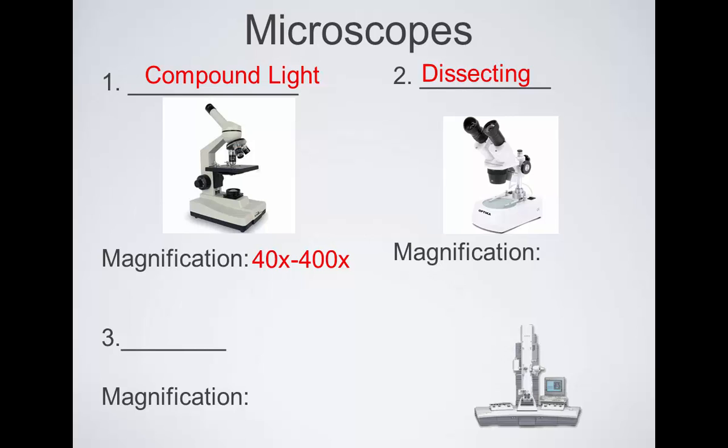That's an important difference because on this microscope, for example, the compound microscope, could I look at my hand through this? No. I could not. Why could I not? The light went up here. Yes, my hand is too thick.